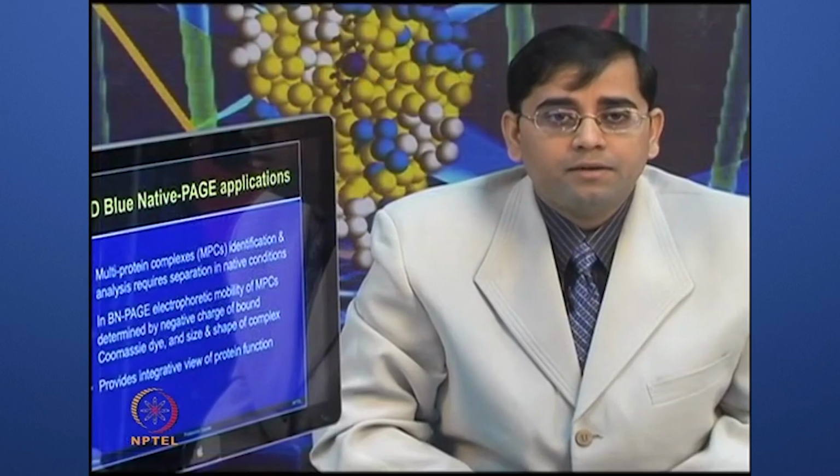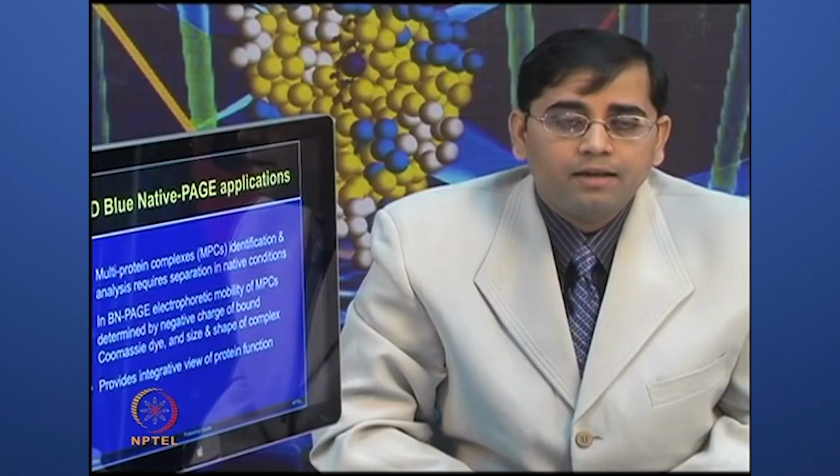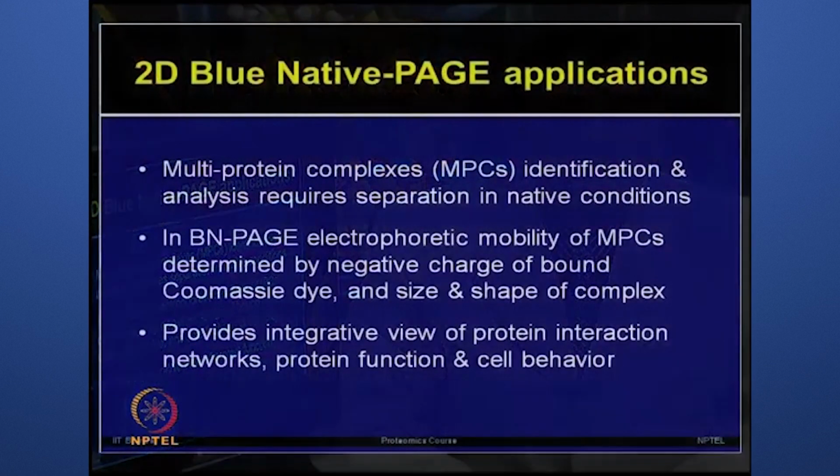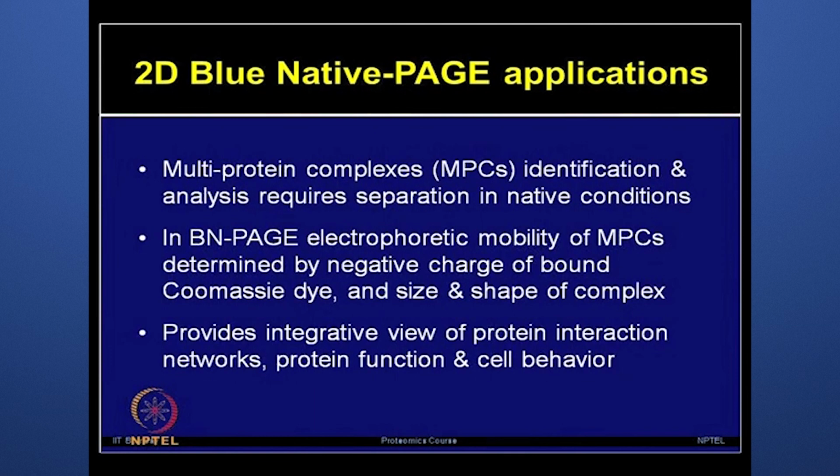People apply the 2D blue native page for various applications, such as studying the multi-protein complexes or MPCs. So, identification of multi-protein complexes is not possible by using the SDS page or denaturing environment.